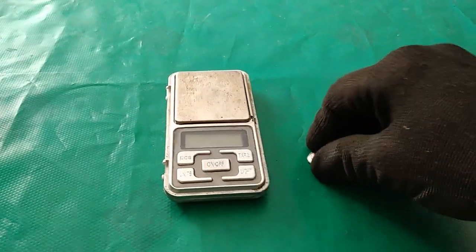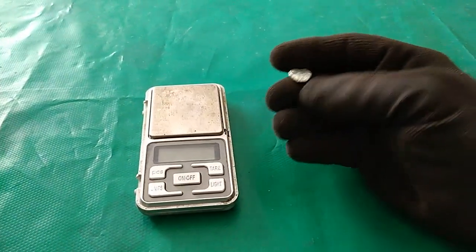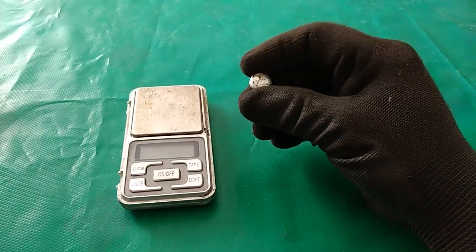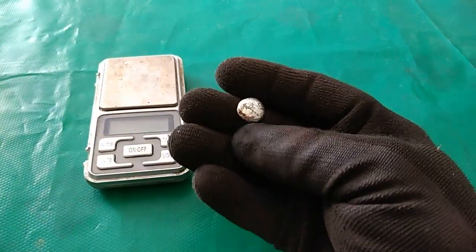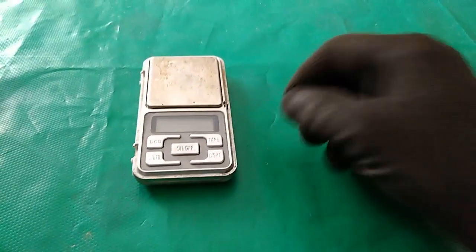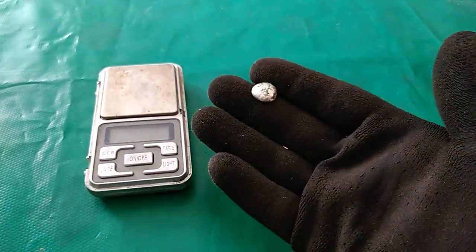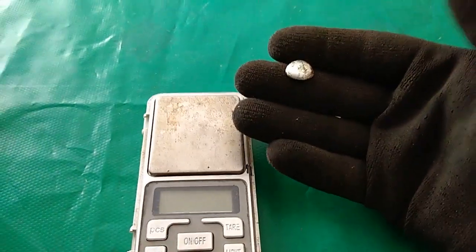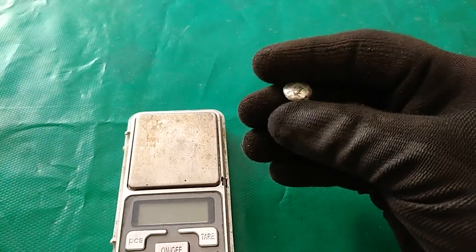Finally, we have melted our silver. Unfortunately my cameraman wasn't able to film the melting point safely on camera. This is the silver bead - this is what we get from this amount of silver-plated pins. It's not too much but it's almost pure silver.